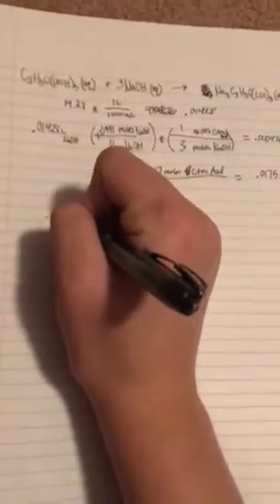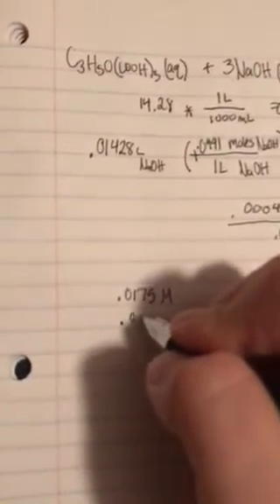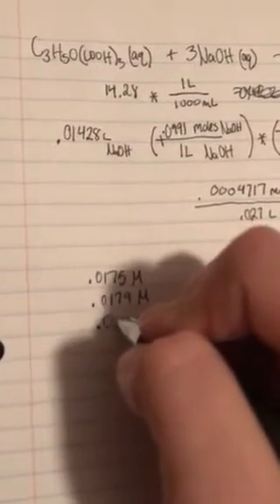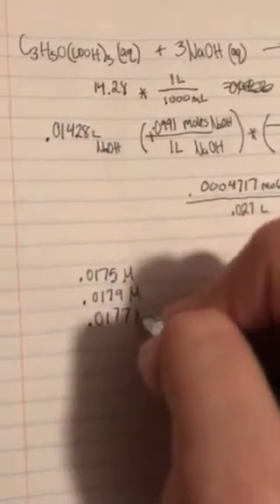The next question that we're going to go over is determining the averages of our concentrations from the three titration cycles that we did. This was from my first one. I'll go ahead and write that out. For my second one I had 0.0179, and for the third one I had 0.0177.